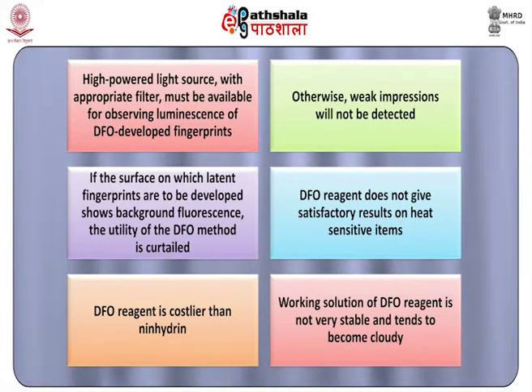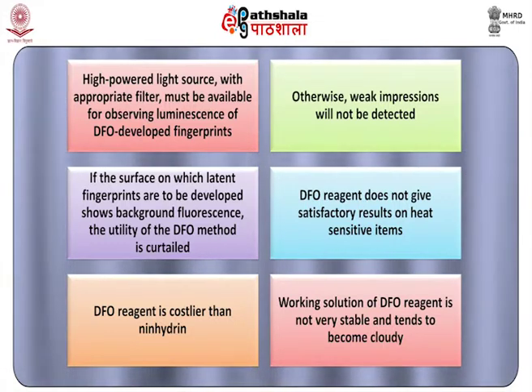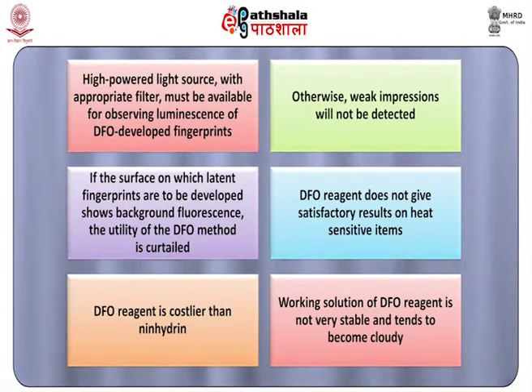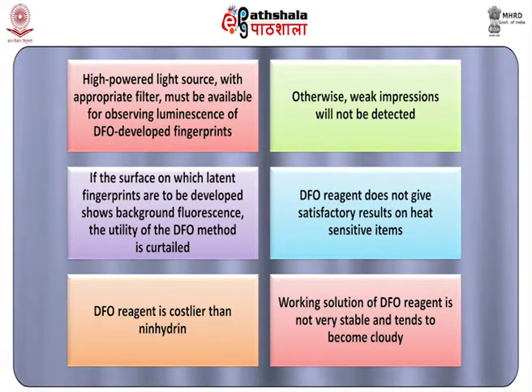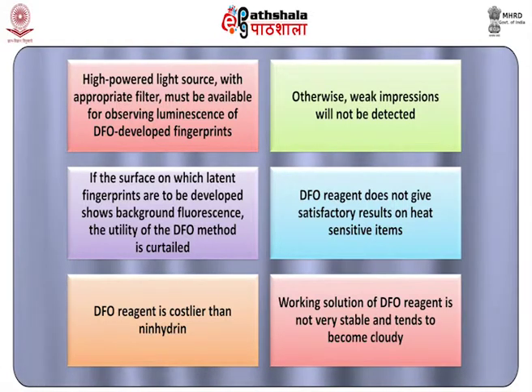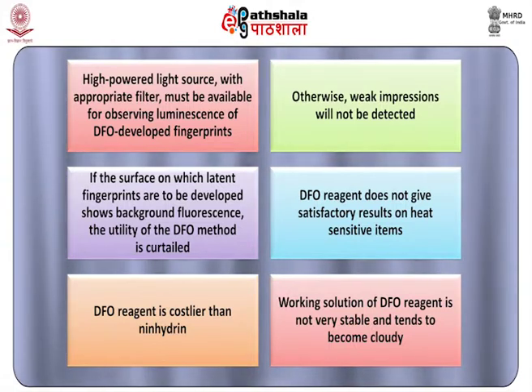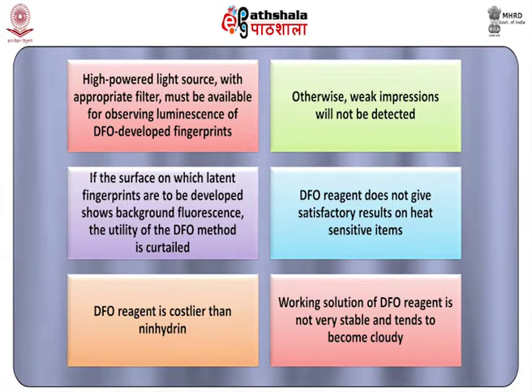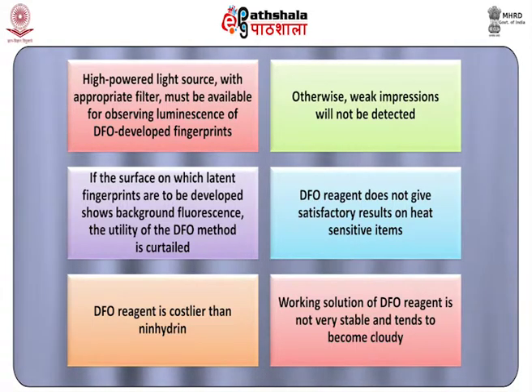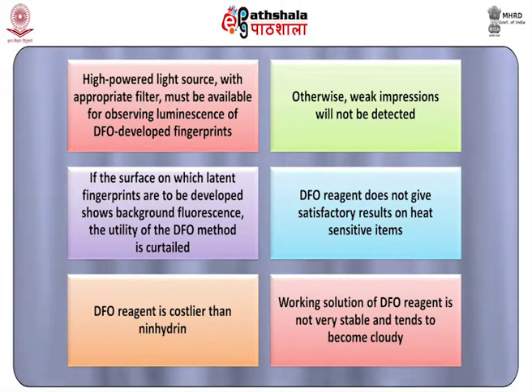Number 3. DFO reagent does not give satisfactory results on heat sensitive items like thermal paper, window envelopes, and labels on polyethylene articles. Number 4. DFO reagent is costlier than Ninhydrin. Number 5. The working solution of DFO reagent is not very stable and tends to become cloudy.